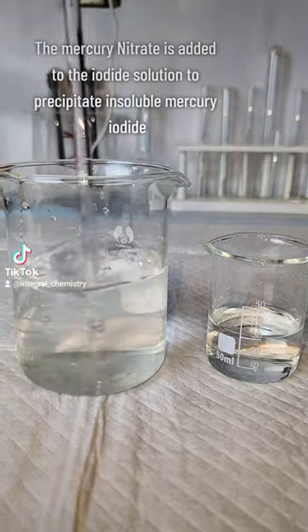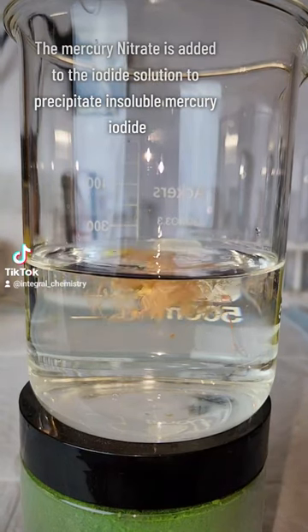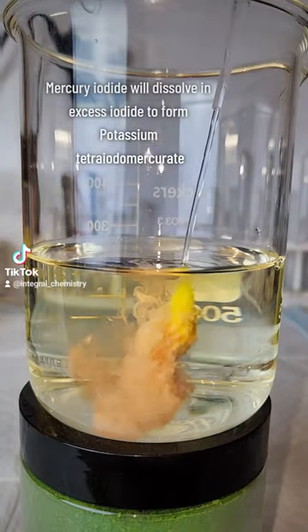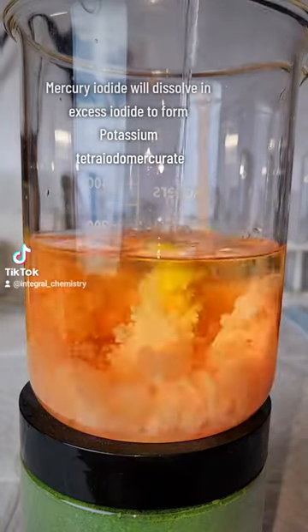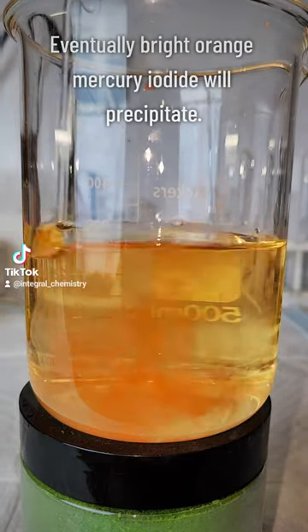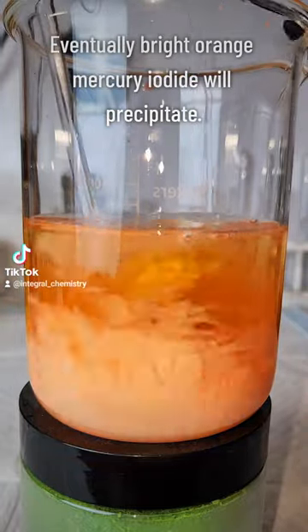Anyway, once the mercury is totally dissolved I make a 0.2 molar solution of potassium iodide and slowly add the mercury nitrate to it. At first no precipitate is going to form, as mercury is able to form a very soluble complex with excess iodide. Eventually though, the bright orange mercury iodide will begin to precipitate and fall out of solution.